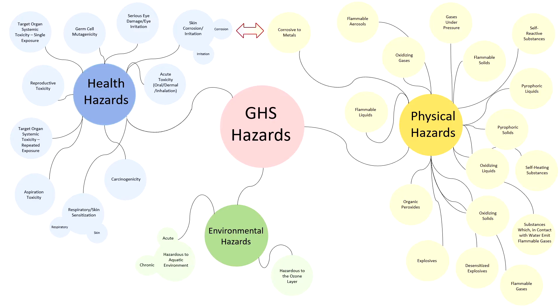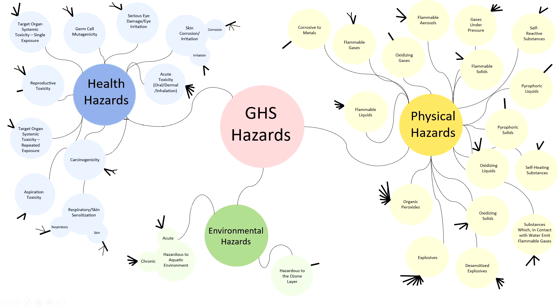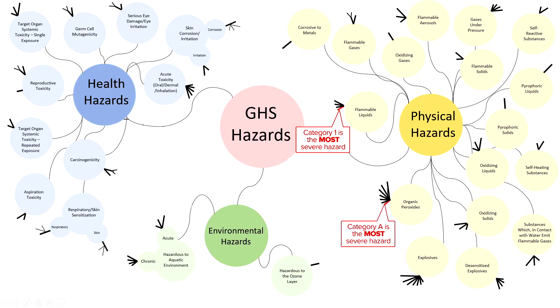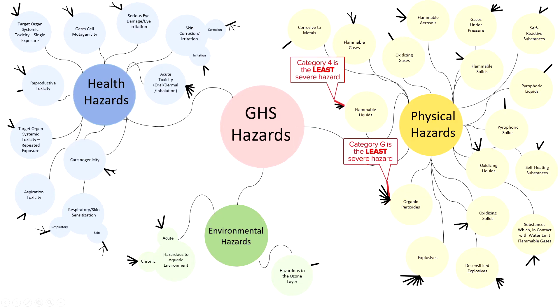Within each GHS class, chemicals are designated into categories based on the severity of their hazards. Categories are shown here by black lines attached to the class circles. The most severe category is given the lowest number, 1, or the earliest letter, A, and is represented by the shortest category line. There is no set number of categories per class.